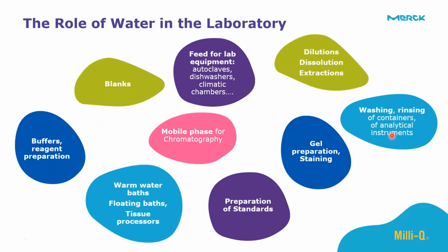containers of analytical instruments. We also have dilutions, dissolutions, and extractions of samples, and also to feed the autoclaves, the dishwashers, and so on. And of course, it's widely used as a mobile phase for chromatography. So this is really just a few of the roles that water plays in the laboratory, and it underscores what we said before, that water is the most widely used reagent in the laboratory.